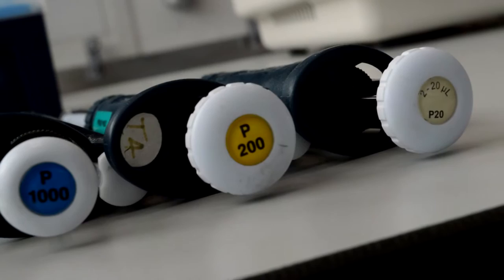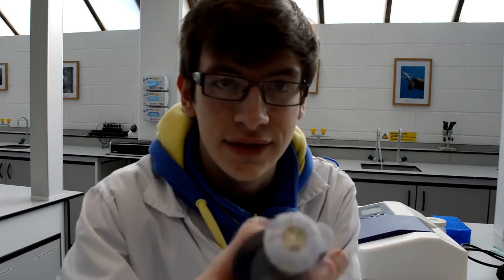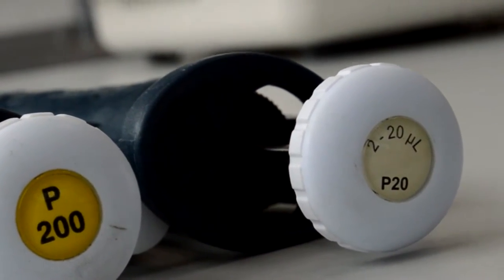And by that, what I mean is the number on the top, divide that by 10, and that's how low in microliters you can go to. For example, a P1000 will go from 100 microliters up to 1,000 microliters. A really good example of that is right here with a P20. It goes down to 2 microliters and all the way up to 20 microliters.